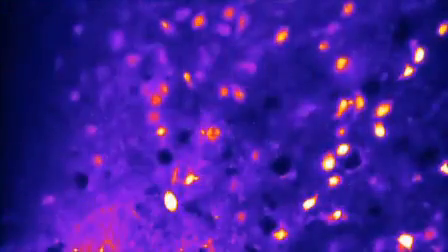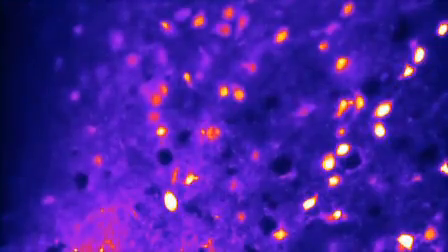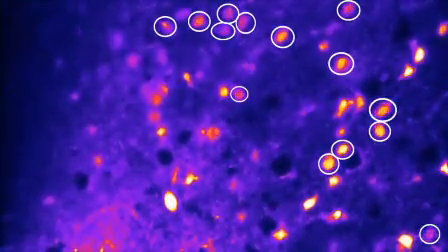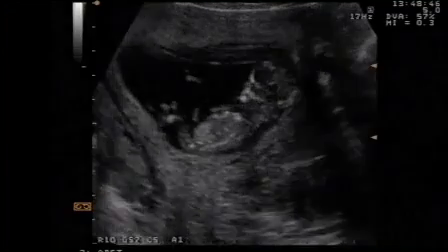A hallmark pattern of activity in the developing nervous system is spontaneous, synchronised network activity. Synchronised activity has been observed in many different developing neuronal regions.